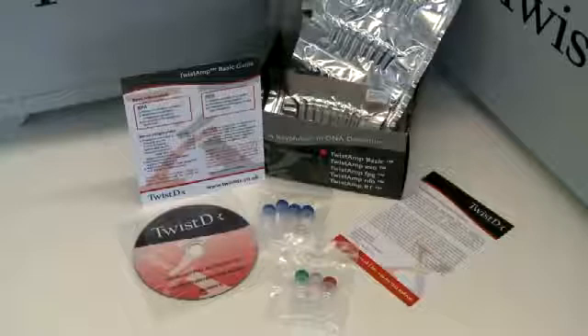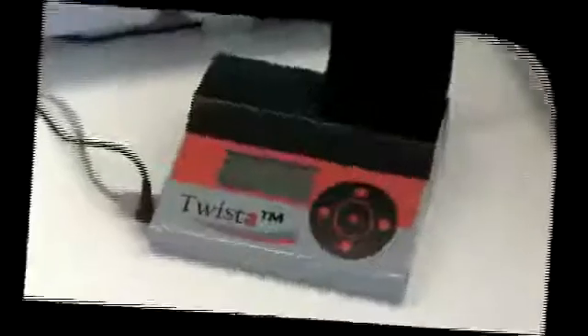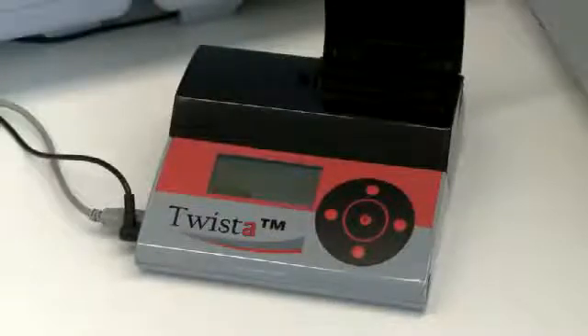In order to run your TwistAmp Basic reactions you'll need to heat them. You can do this using a hot block, water bath, thermal cycler or heated plate reader. We'll be using a twister for this experiment. Switch on your heat source so that it reaches the desired temperature, set to somewhere between 37 to 39 degrees centigrade.